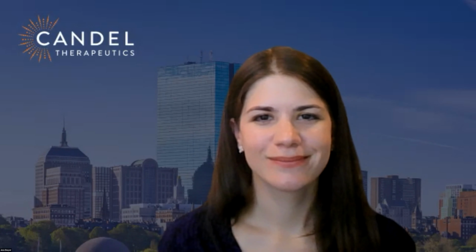Awesome. And so we've got a few more questions here. Did you trial Sample Manager? And if so, how did it go? And did it help with your decision? We actually didn't do a trial of Sample Manager. We spent a lot of time on video calls with Hannah, looking into some of the different things that we wanted to do with the implementation. And once we saw Hannah walking us through it, we were comfortable to go ahead.